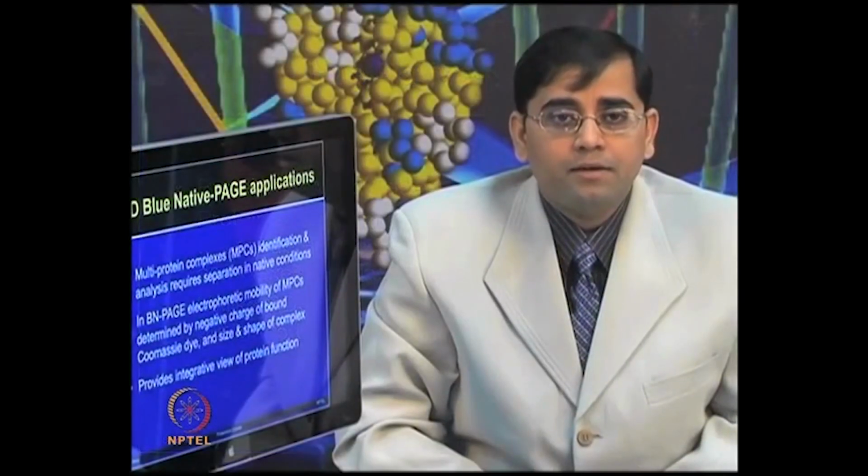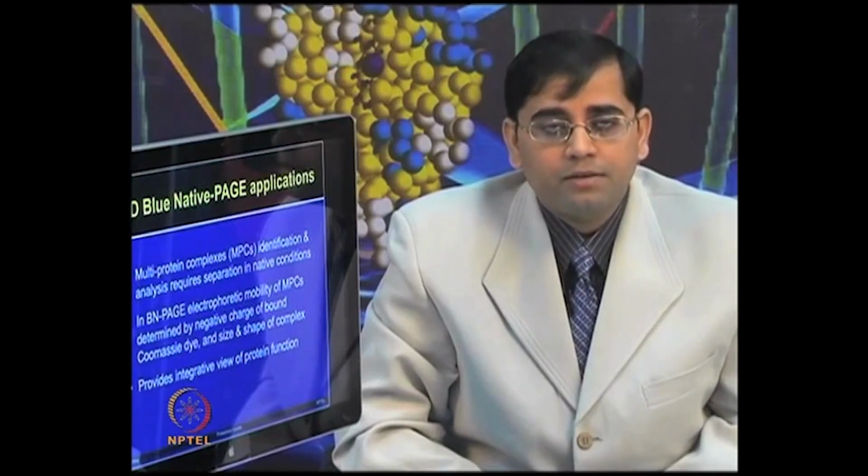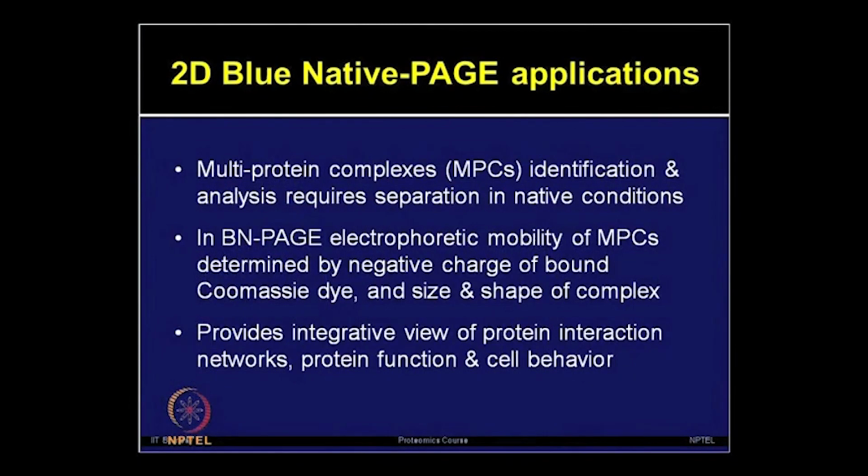People apply the 2D blue native PAGE for various applications, such as studying multi-protein complexes or MPCs. Identification of multi-protein complexes is not possible by using SDS PAGE or a denaturing environment. So, MPCs can be identified by using blue native PAGE.